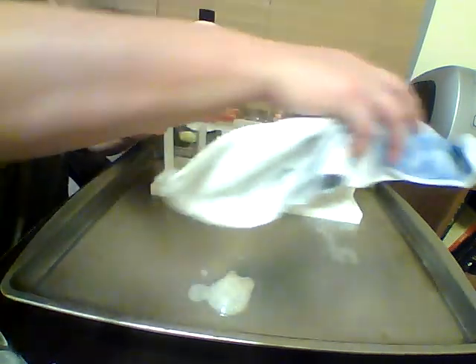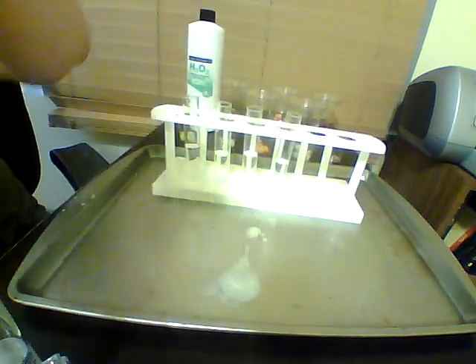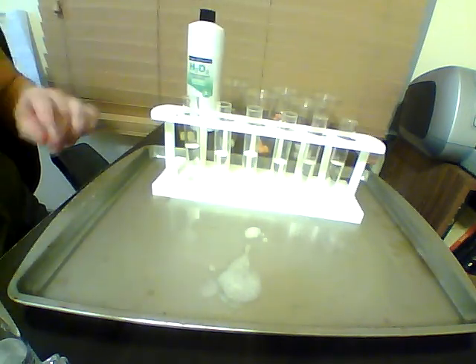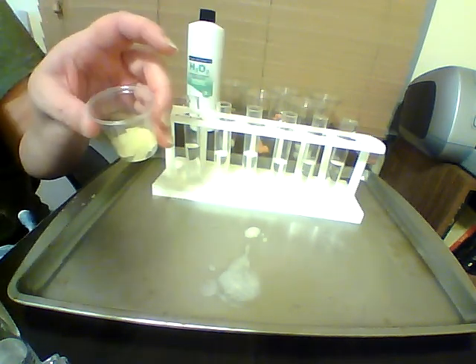And I have another set of test tubes ready to go. So we have a new control. Pineapple, banana, carrot, potato, and liver. And this time the samples that I'm going to use are cooked. So I cooked these by heating them in a cup of water in the microwave for about 2 minutes.